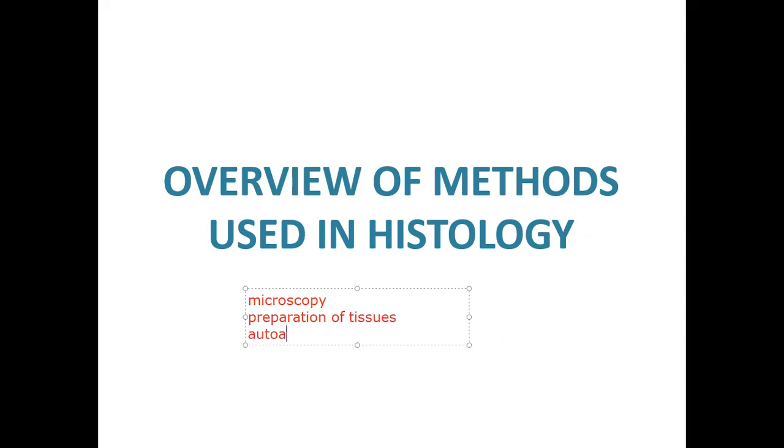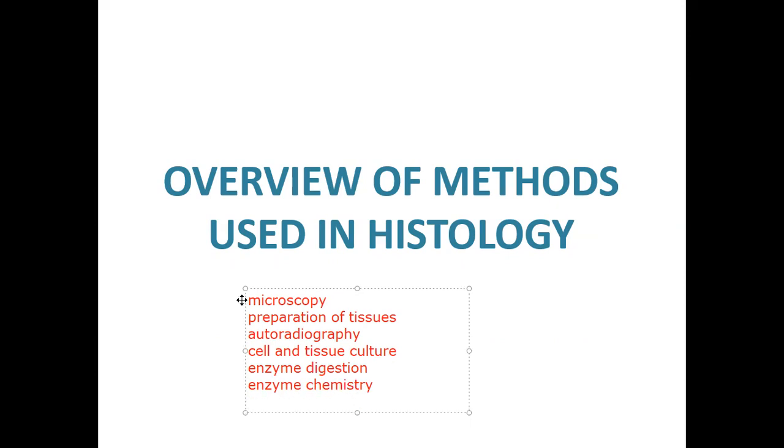And then we also have autoradiography, cell and tissue culture, enzyme digestion, enzyme chemistry, and of course we have visualization of molecules using techniques like immunohistochemistry and hybridization techniques.